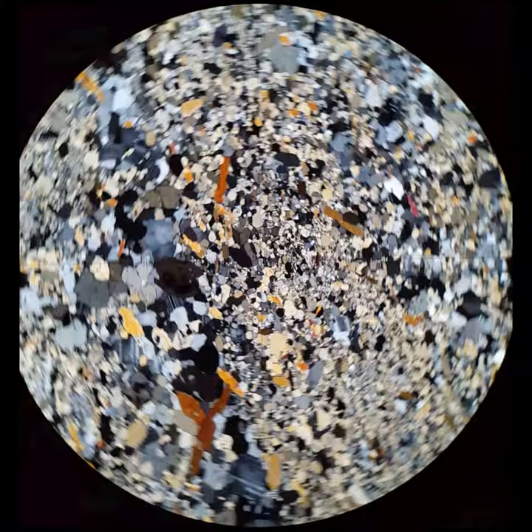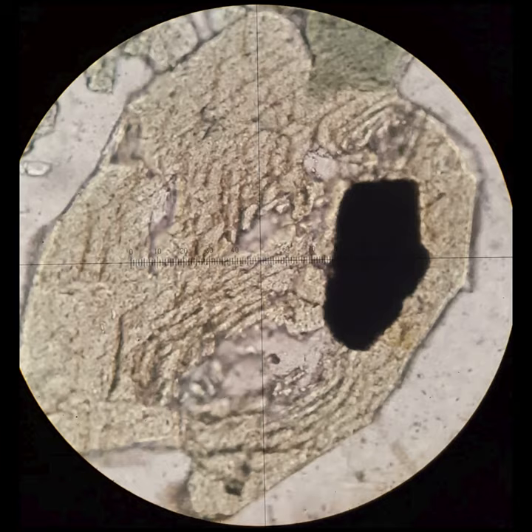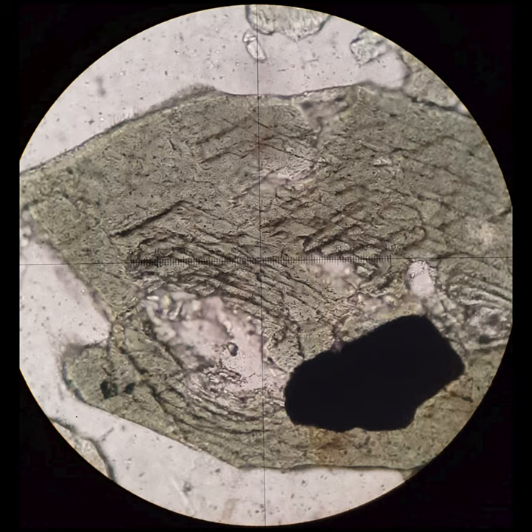but is in a part of the section that is not made very well. If we zoom in on this particular grain, right here, and then we go to higher magnification, now you're going to see it has 60-120 cleavage, but it's also part of the section that was not made very well. So that's one trick to finding these cleavages.